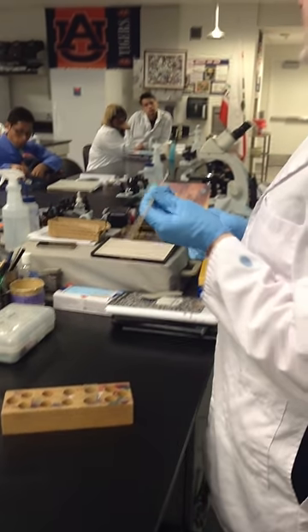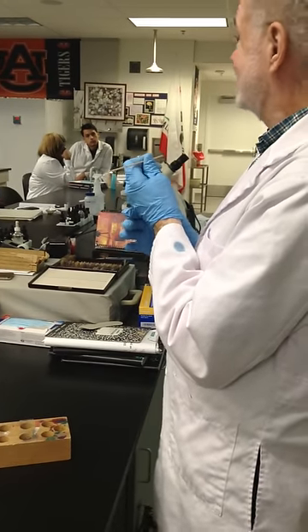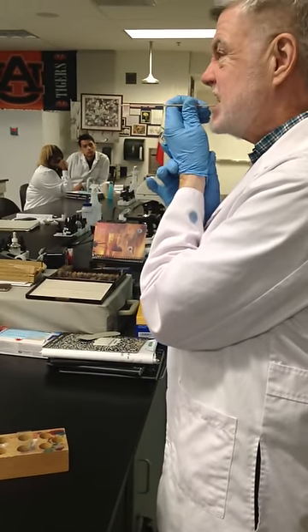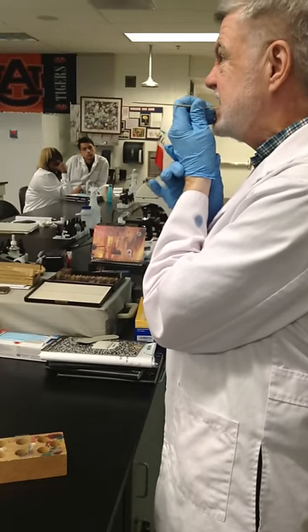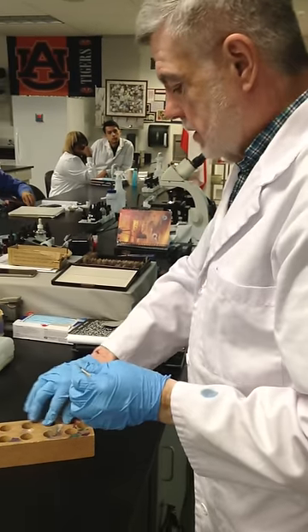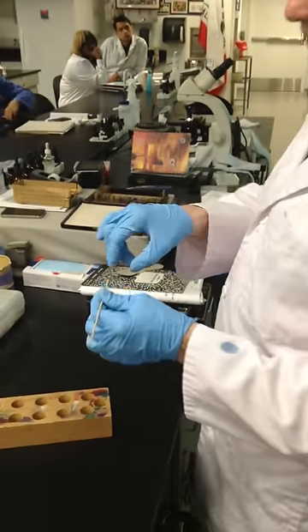Grit your teeth and go between tooth and gum — don't get gum, that's epithelial cells. Just get the white plaque. Then turn the stick over and smear it on the slide.